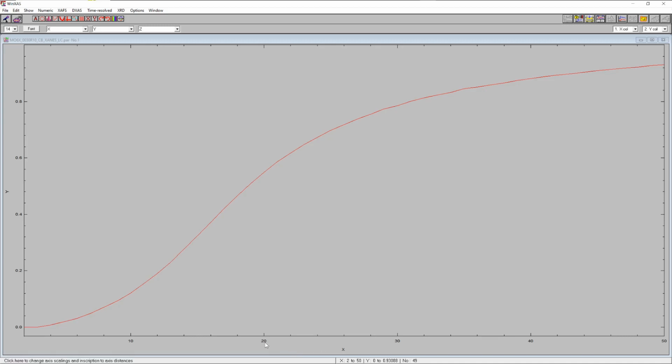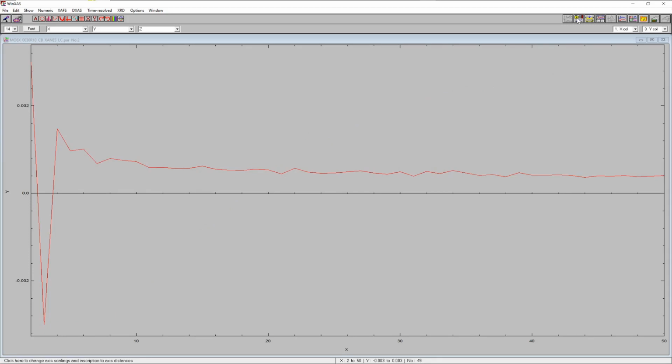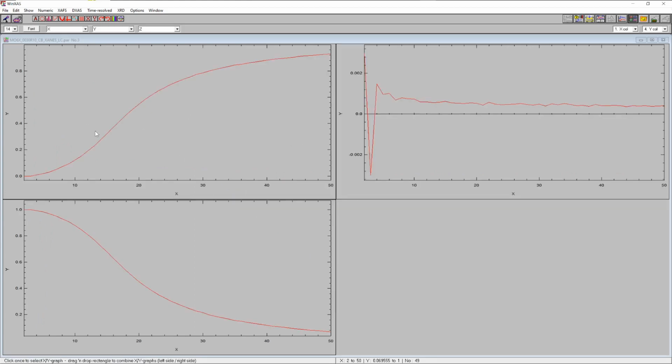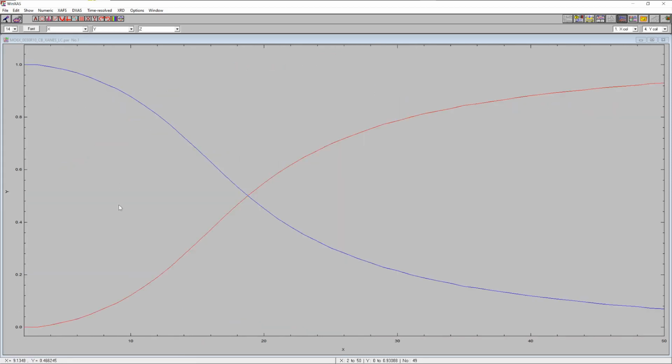The x-axis always is the number of the column, basically. So if that was time, or if you wanted to transform it into time or temperature or whatever the parameter is on the x-axis, then you could of course do this, but the program basically now only displays the column number. There's no further information available there. So this is the first column. The next column now would be the energy shift, and then this is the concentration of the trioxide, basically. This is the order we had this, so this is what we get.